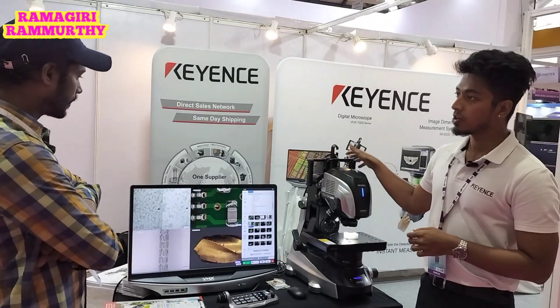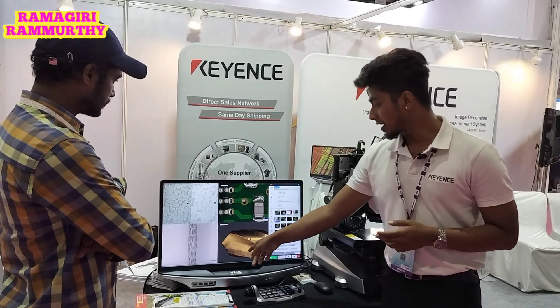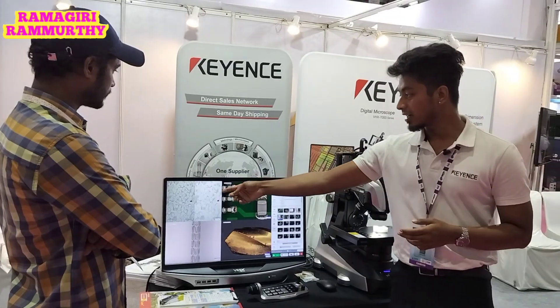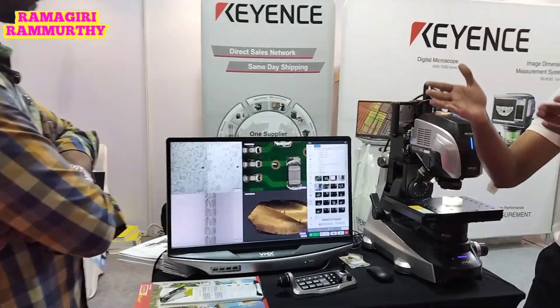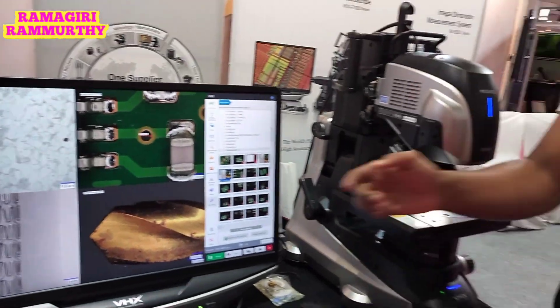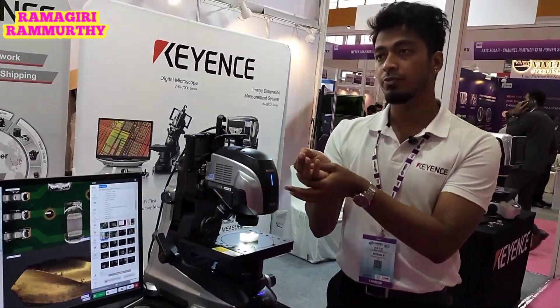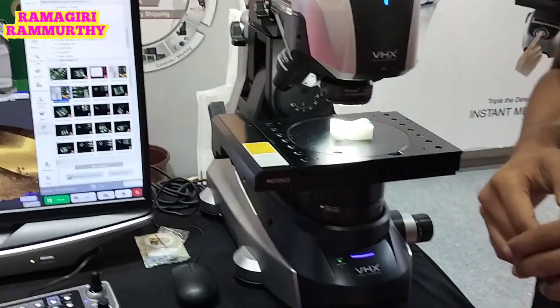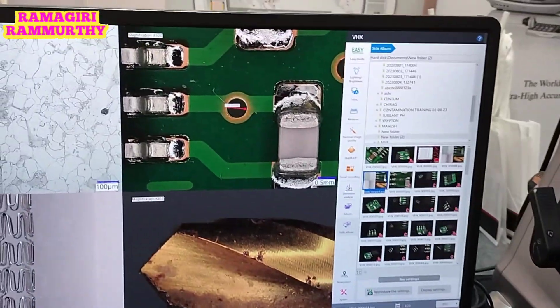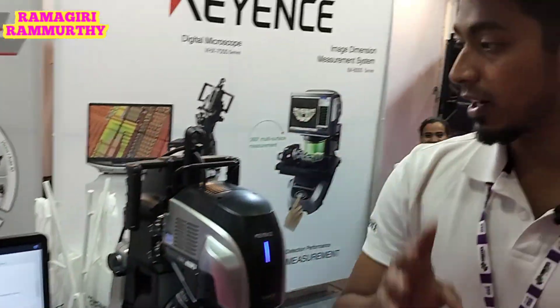This is a versatile system — we can do multiple applications. As you can see, this is four different applications in one shot: a metallurgical application for microstructure analysis, PCB-related electrical applications, tool inspection, and applications for pharma industries. This is a one-stop solution for multiple applications.